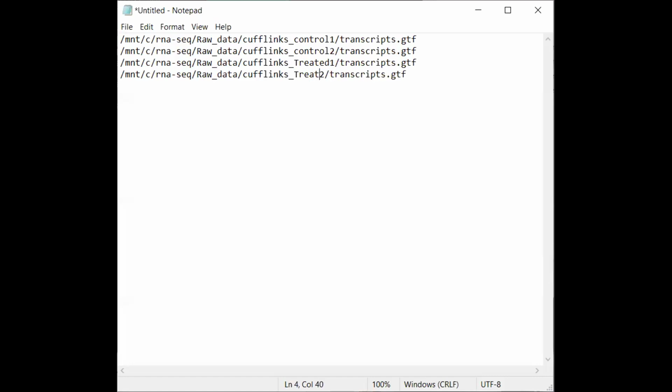Ma'am, for me it's coming command not found, for every step in the result. So did you perform this? Yes, ma'am. Can I share, ma'am? No, just wait.